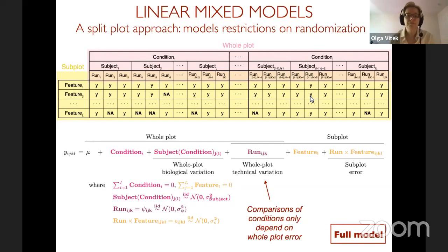What we usually do for the moment, we do something fairly simple. We select quote unquote best fraction for this feature and just keep the intensities from this fraction. And the best can be defined as highest intensity and things like that. So we don't do any fancy modeling there. We just keep one fraction for this feature. But all the features from multiple fractions, they just become part of this data structure.